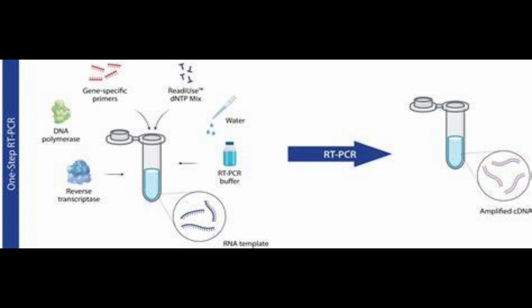To understand this system, we can compare it to the familiar concept of two-step verification in the security system of TikTok or Facebook. Instead of relying on a single confirmation step, the system uses an additional verification layer to improve reliability. In standard PCR or allele-specific PCR, primers bind to the target sequence and amplification proceeds if binding is sufficiently stable. However, in some cases, especially in rare variant detection, a mismatch may still be tolerated by a DNA polymerase and hence allow for amplification, giving a false positive result.